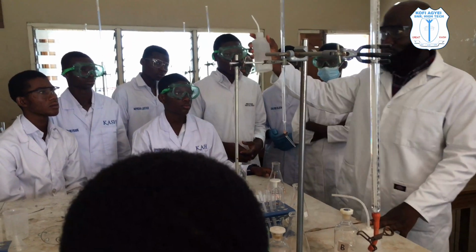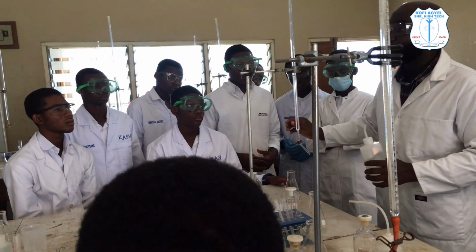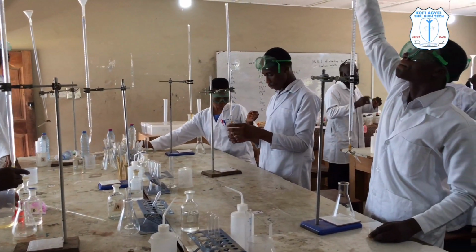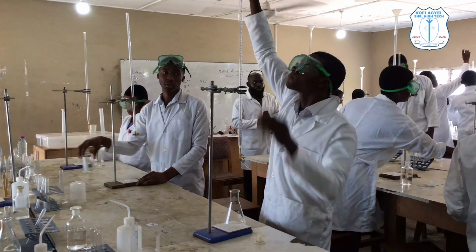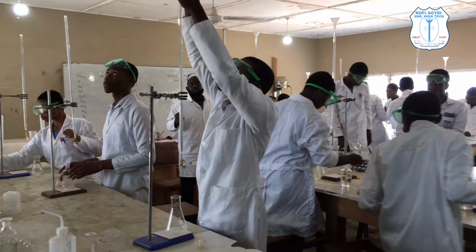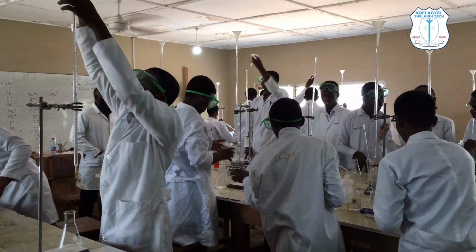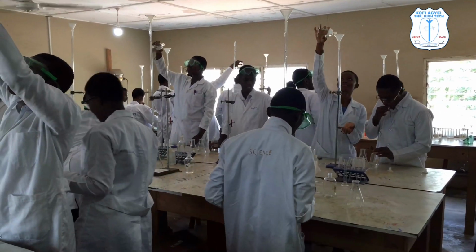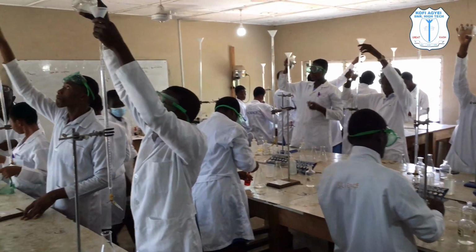Now this one is the wash bottle. After everything, you use the wash bottle to rinse them nicely. Please pay attention. So first, insert the clip nicely. Insert your clip. Pour the acid gently into the burette.